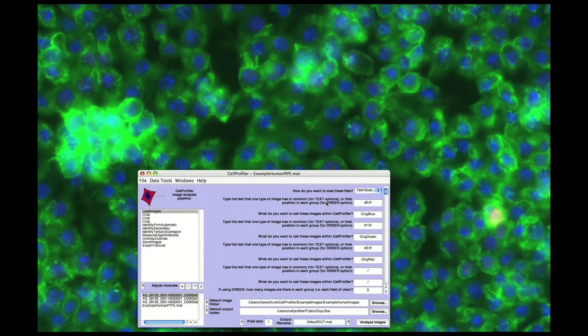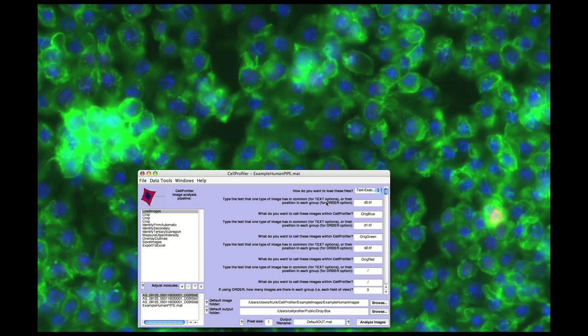Hello, and welcome to Cell Profiler. In this short movie, I will demonstrate some of the features of our software as an image analysis tool for identifying and quantifying cell phenotypes. All the images and pipeline I will be using in this demo can be downloaded from our webpage, www.cellprofiler.org.